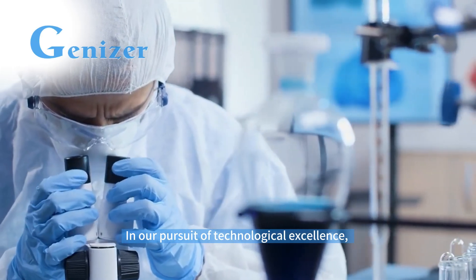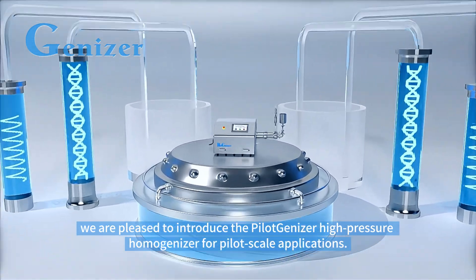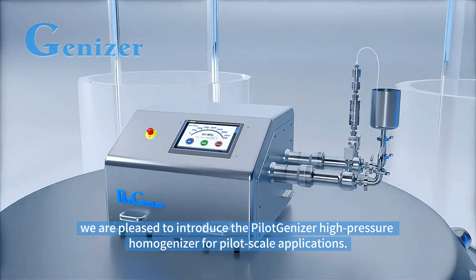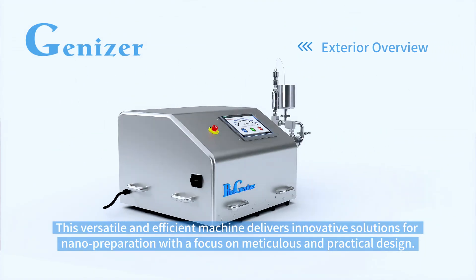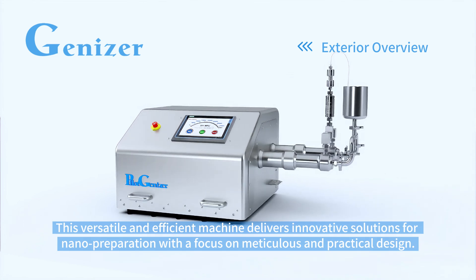In our pursuit of technological excellence, we are pleased to introduce the PilotGenizer high-pressure homogenizer for pilot-scale applications. This versatile and efficient machine delivers innovative solutions for nano-preparation with a focus on meticulous and practical design.